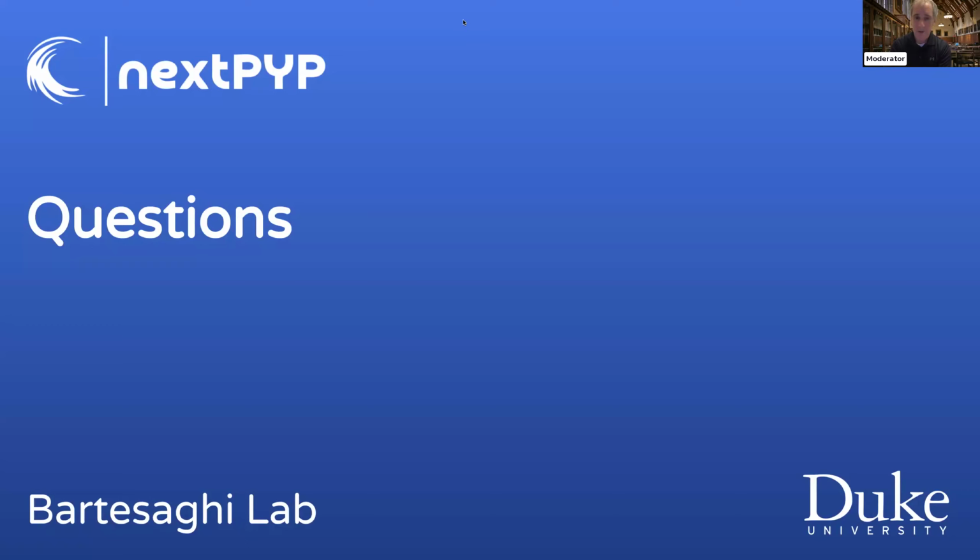Whether you should use bisect or not, I think if you can, you should, unless you have unlimited access to the microscope. Bisect will allow you to get a lot more data per microscope hour. So if your sample supports that and you're set up to do it that way, you should definitely use that, because you'll get a lot more data per session.